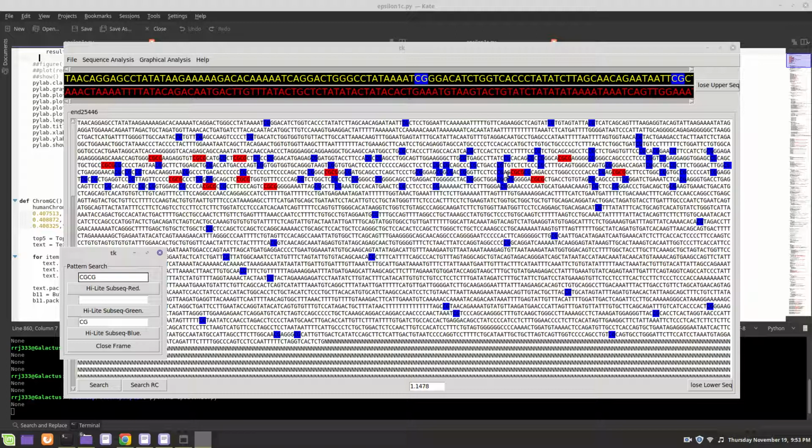There are some ways that I'm going to show you to find that, but they're not readily available to you guys. There's some software I have that you don't have access to, which helps find that CpG island. But we're going to use the fact that we're in a CpG island to find our transcription start site kind of in reverse, and I'll explain that.